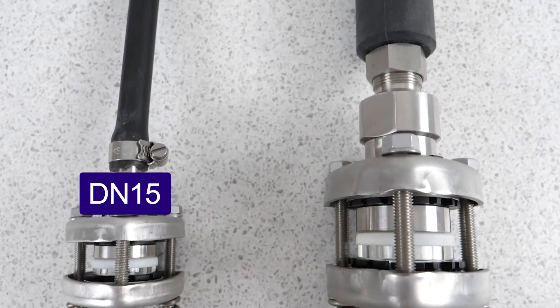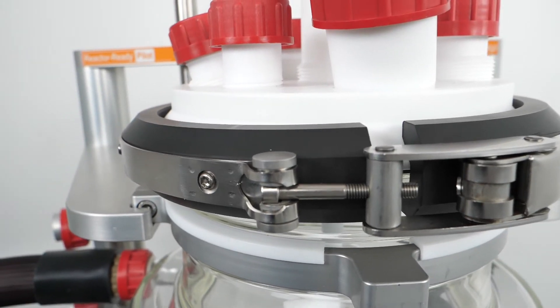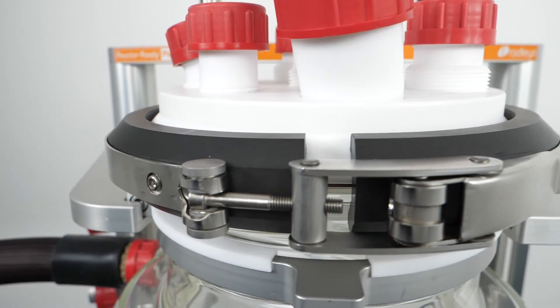Draining and replacing the heat transfer fluid and the use of traditional couplings often means that jacketed lab reactor systems are rarely, if ever, dismantled.